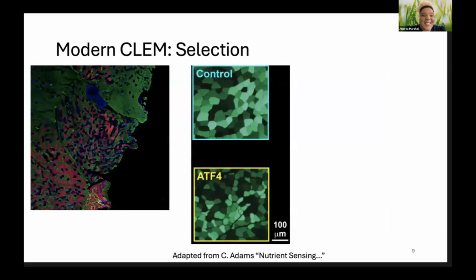So taking it back, old school, I have done a ton of fiber typing. The image that you see on the far left is fiber typing of mouse gastroc. You see a combination of three muscles: the gastrocnemius, both the medial and the lateral heads, and the plantaris. You see the nerve that goes through that bundle, as well as part of the soleus.